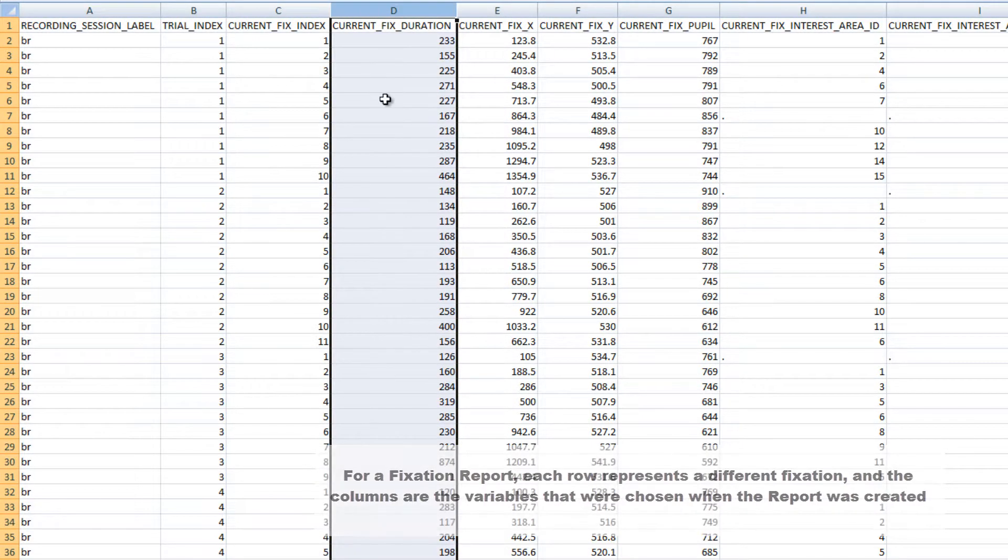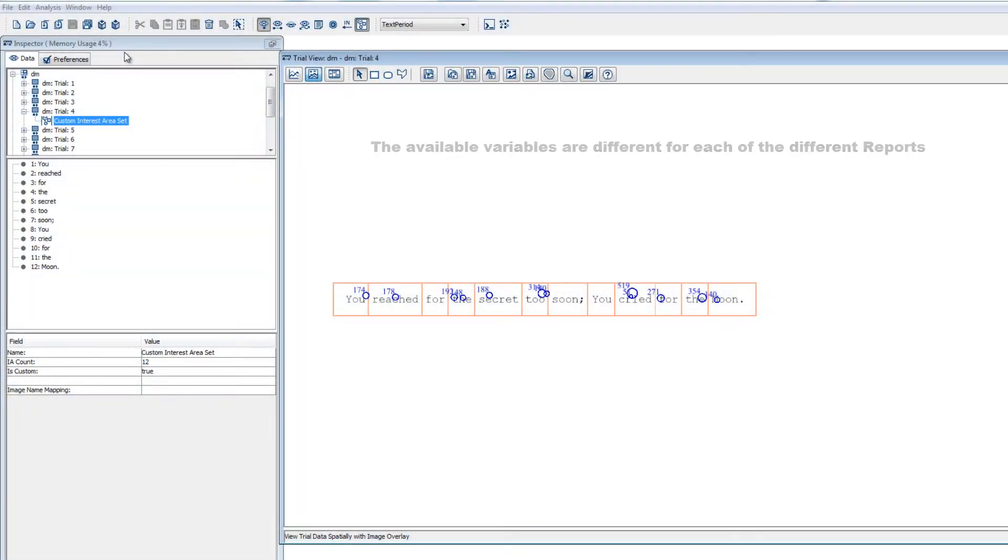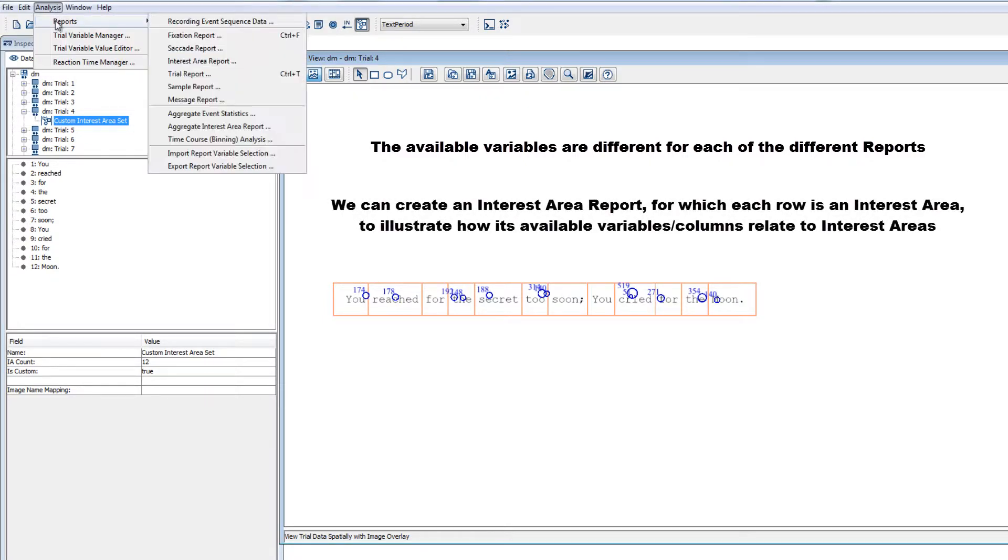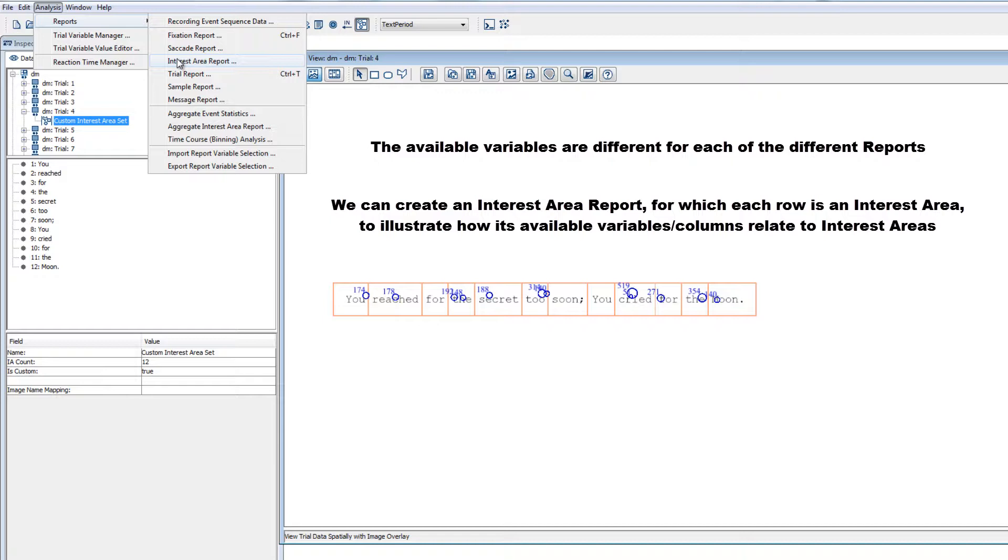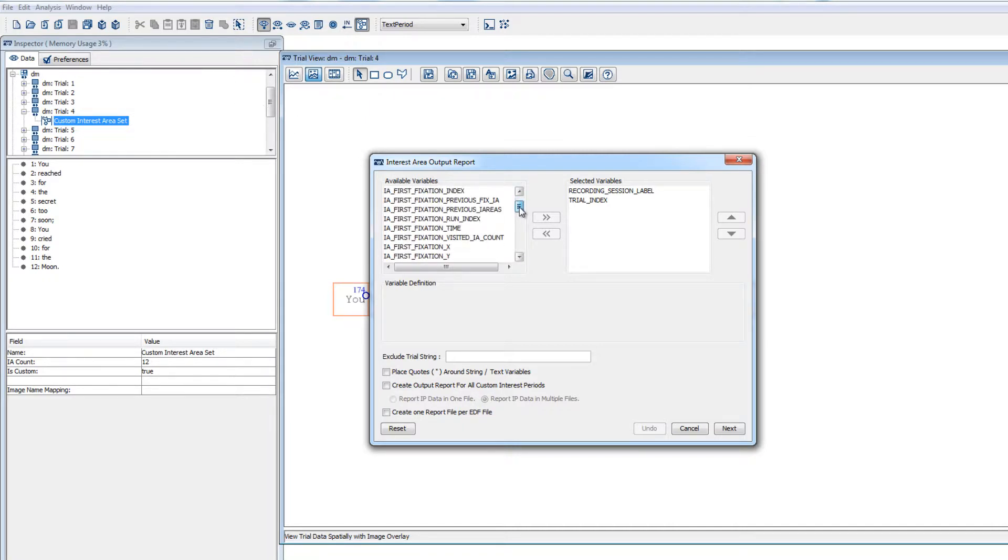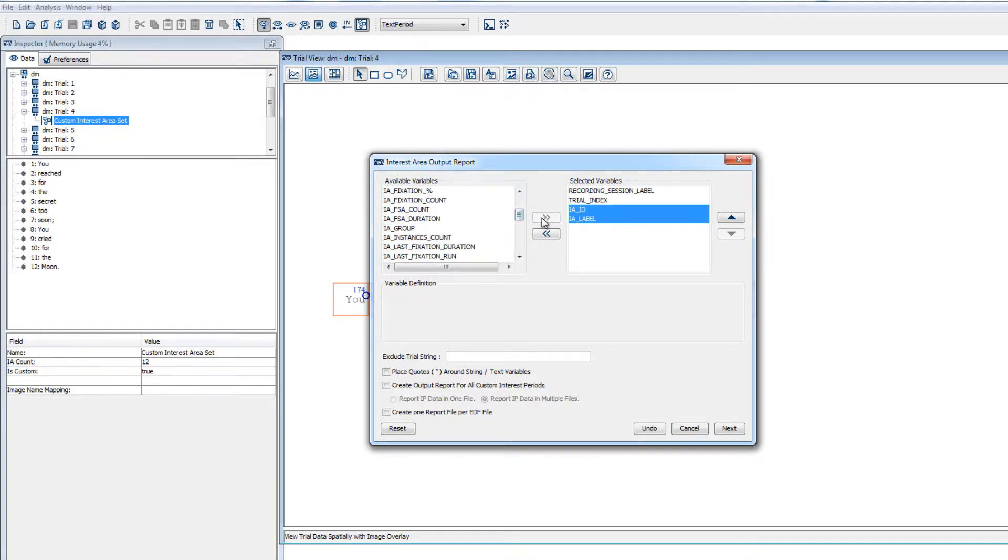The available variables are different for each of the different types of reports. An interest area report will be organized such that each row is an interest area, so its available variables are ones that will relate to interest areas. We can create an interest area report to illustrate this. For an interest area report, we'd probably want to include information about the interest area ID and label first. Since each row will be a different interest area, this will help us to identify which interest area a given row corresponds to.